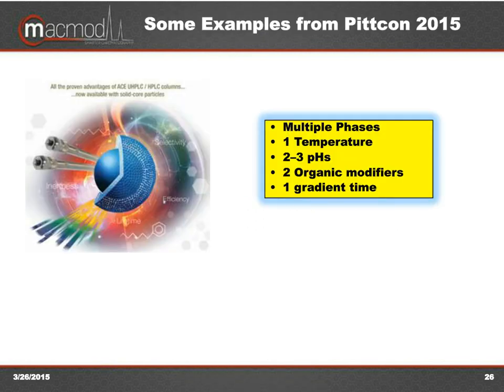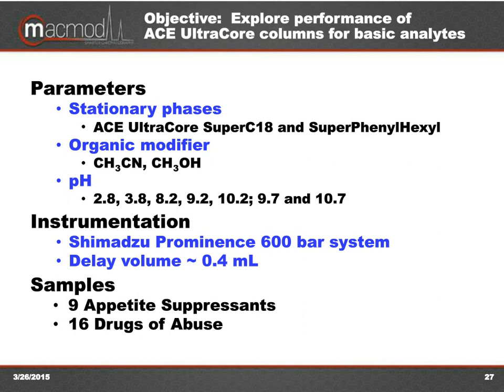Now, what I'd like to do is switch gears just a little bit and show some of the findings from my first experiences working with these phases, in preparation for a presentation earlier this month. My objective was to explore the performance of these columns, and I started out by working with a couple of fairly short, narrow diameter columns, 2.1 by 50 millimeter, Super C18 and Super Phenylhexyl.